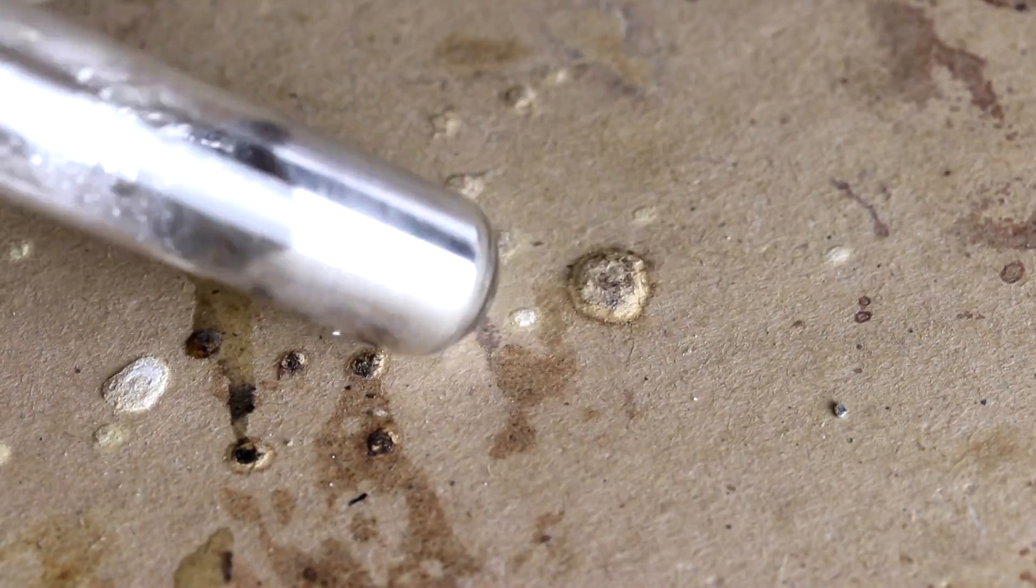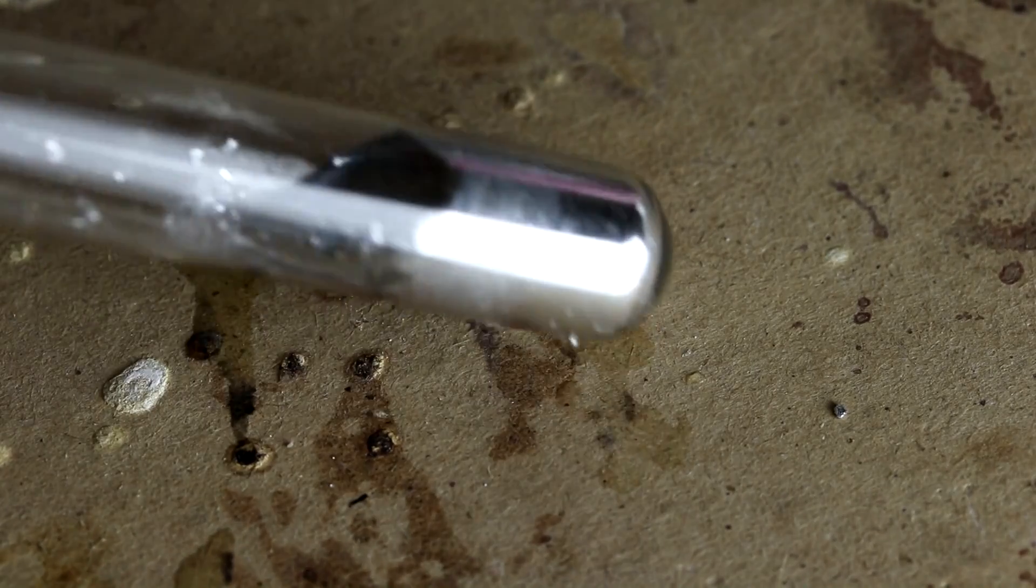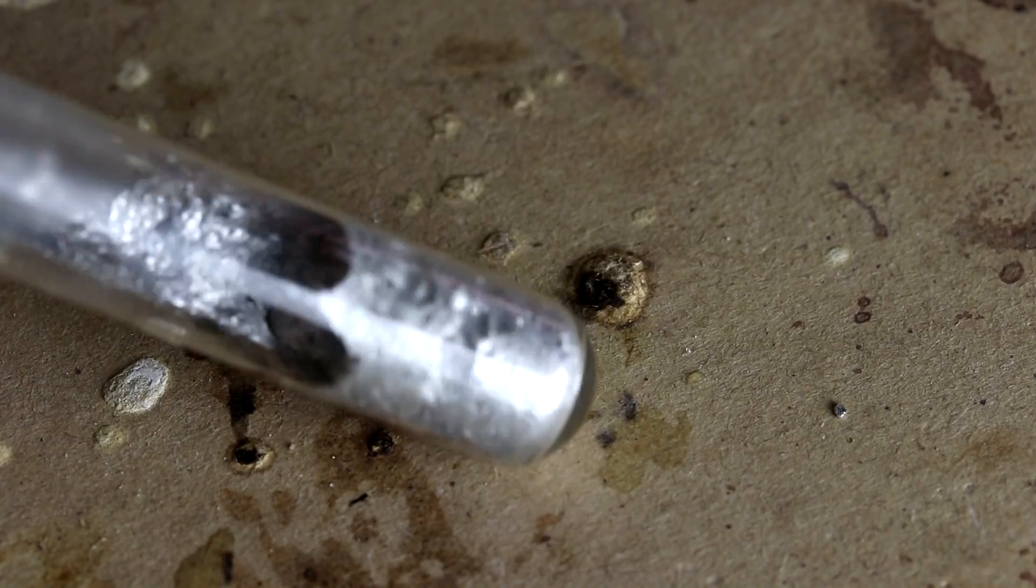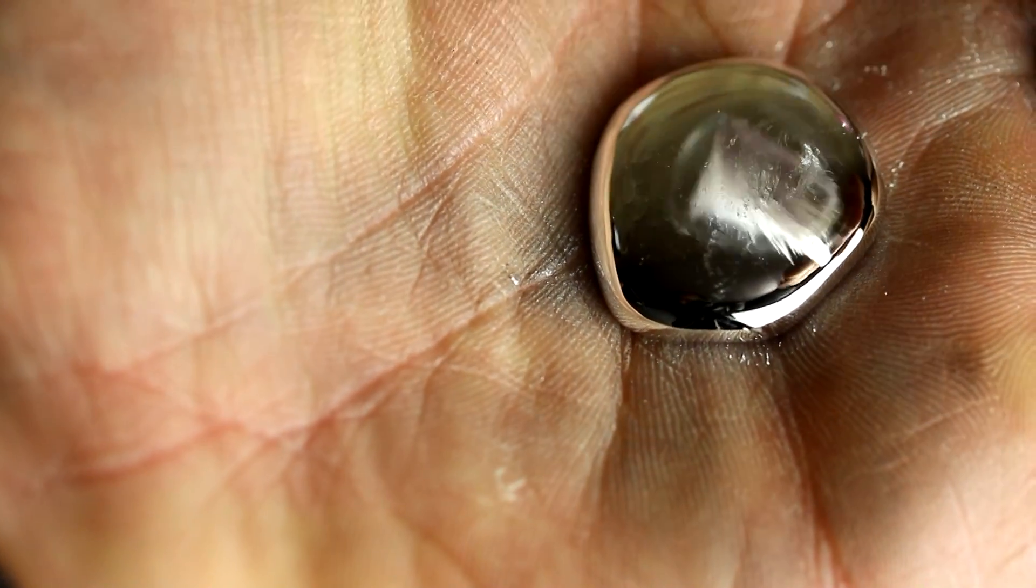So now I've transferred the alloy into a test tube here. There's still some chunks of other metal, tin and indium in there. So I'm going to warm this up to get it to dissolve a little faster, basically melt the metals together. So now that this metal has cooled off, it's safe for me to pour it out onto my hand. There we are, some liquid metal.